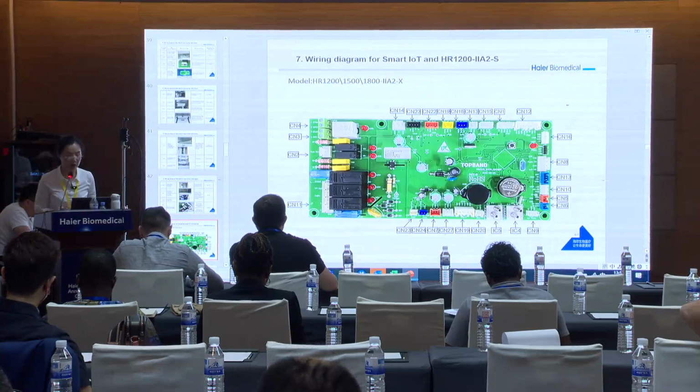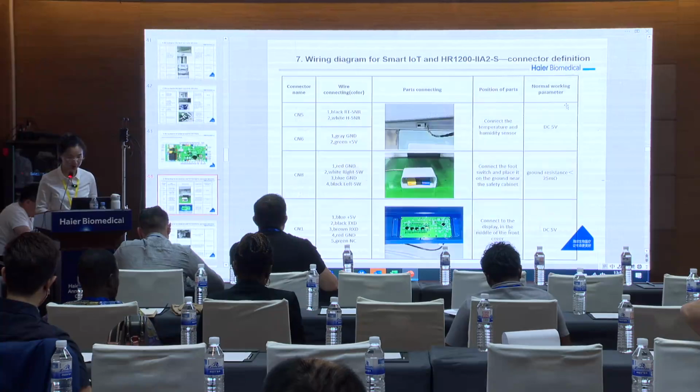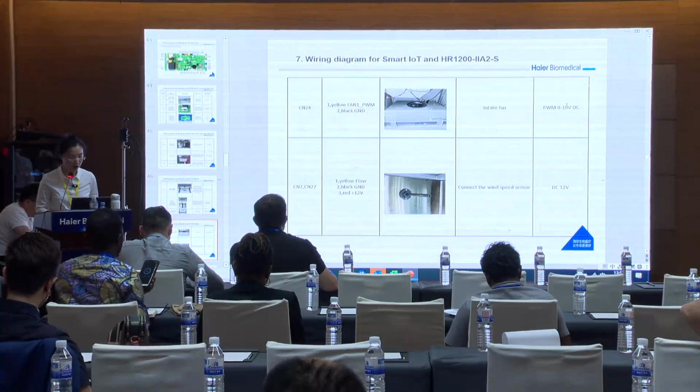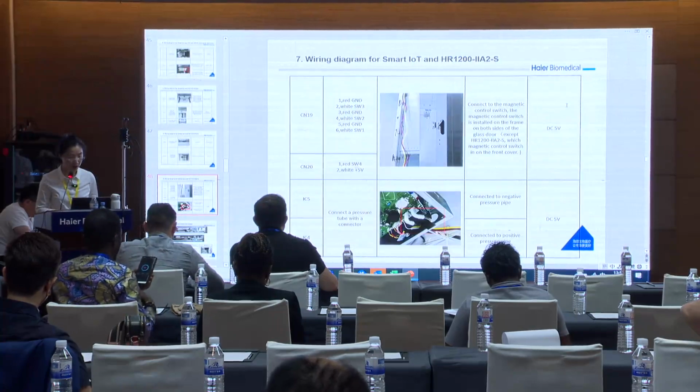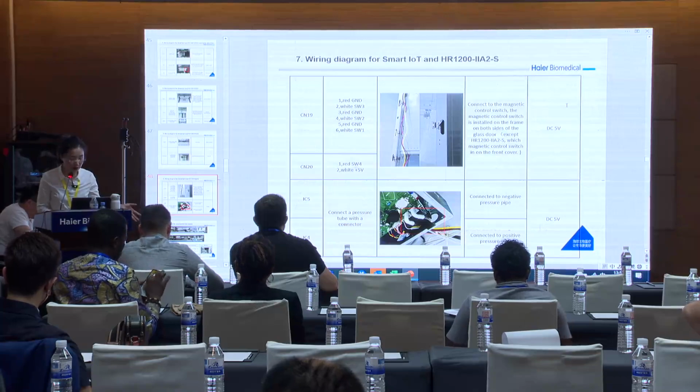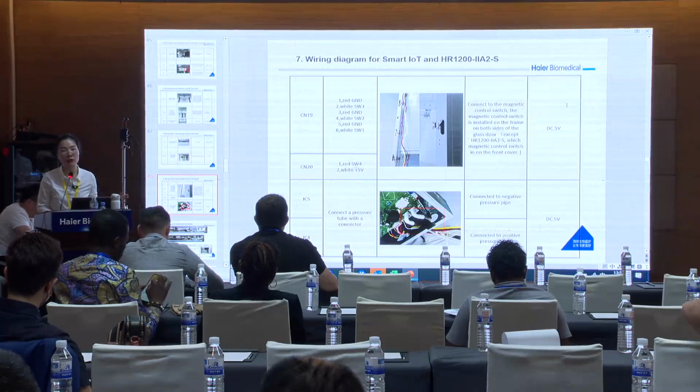And this part is the main control board connector definition for the smart ones. The same logic. This table's function is to help you do some troubleshooting.